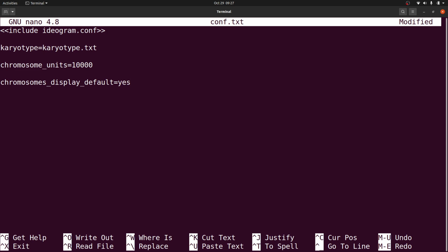And then I also have this. I'll just say image. This is also a block. All right, it's also a block. And then in that block, I'll say include image.conf. Okay, so there it is. And then I'm going to add something else.